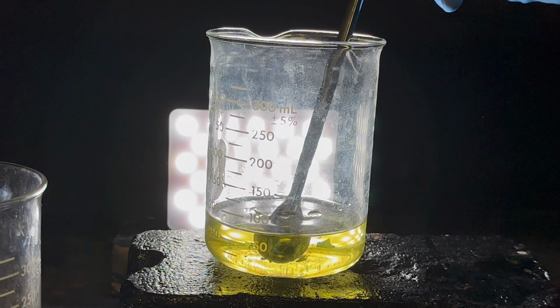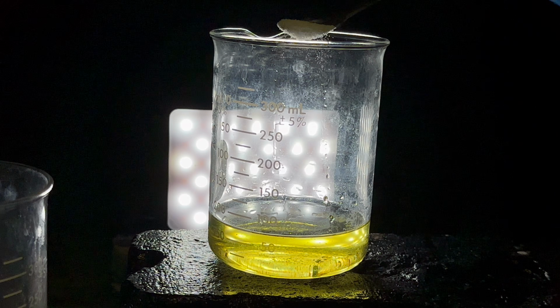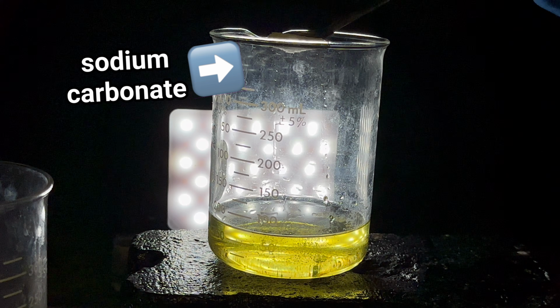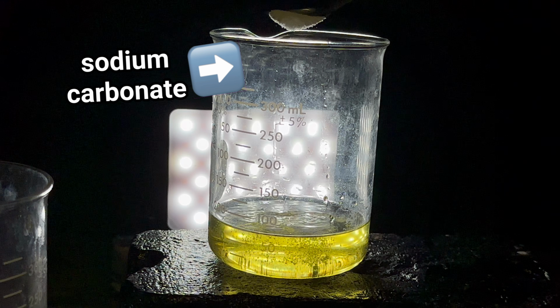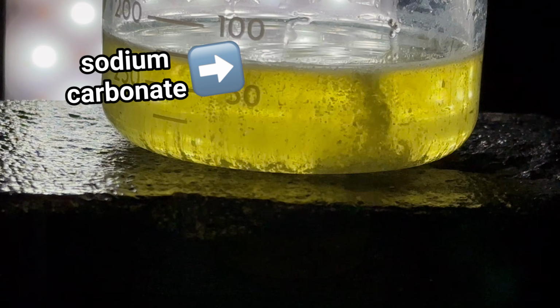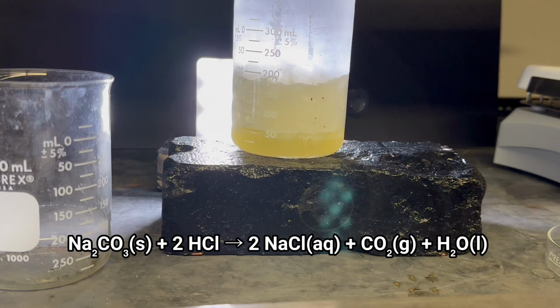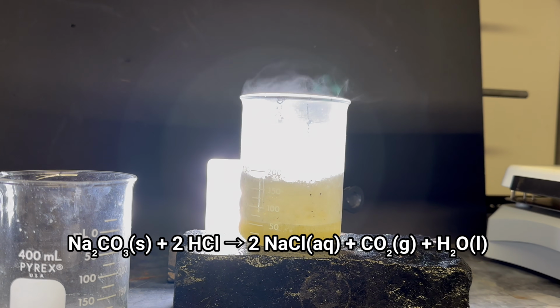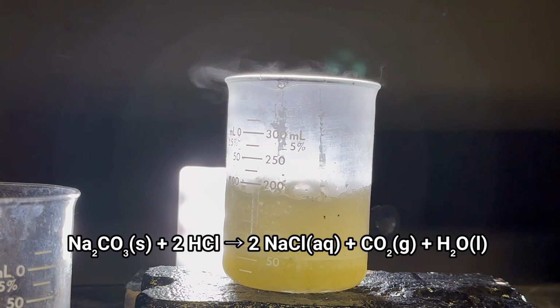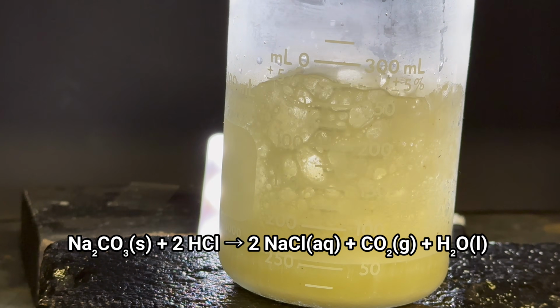I tried to remove as much of this junk as I could, but I couldn't quite get all of it out. My goal at this point was to get the calcium out of solution as a solid I could weigh. Sodium carbonate would do that. But first it had to neutralize all that excess acid, which released a lot of carbon dioxide gas. And because the acid I used was so concentrated, it released a ton of CO2. And I mean a ton of CO2. It also meant I was going to have to add a ton of sodium carbonate to neutralize all that acid.